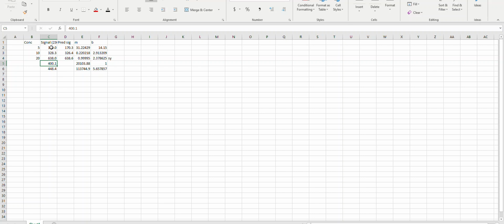So these are all data here. So let's highlight them in a particular way. We could make them sort of light orange, right? Predictions we can make in say light green, right? And now the prediction that we're going to make here is actually not of signal, but of concentration.